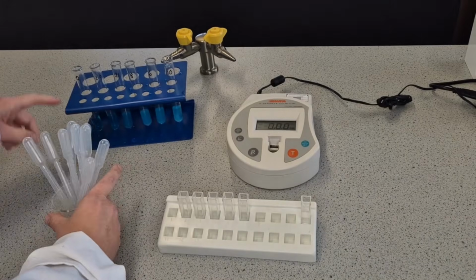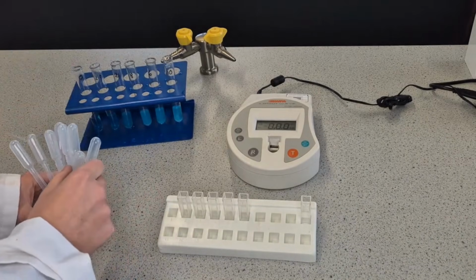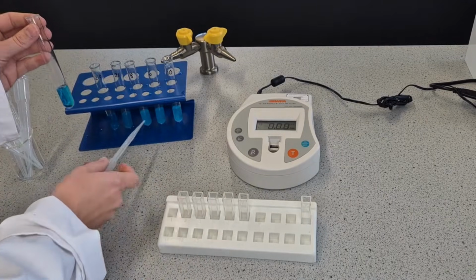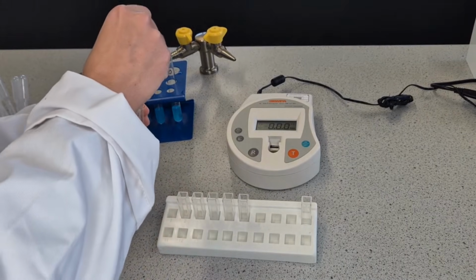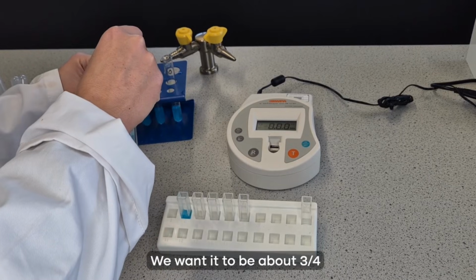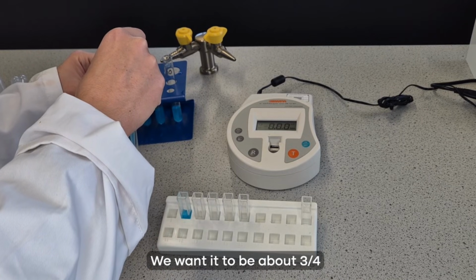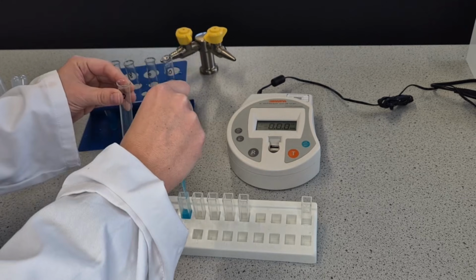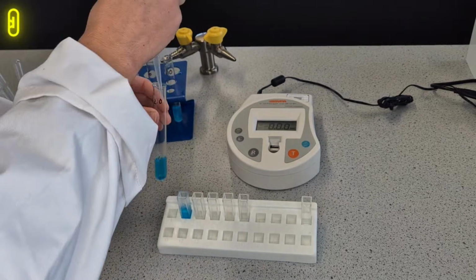I'm then going to use a different drop-in pipette to transfer the solutions into each one. And be very, very careful because the precipitate settled at the bottom and I don't want to draw that up. And I want it about 3/4, or at the very least half full. So that should be fine.